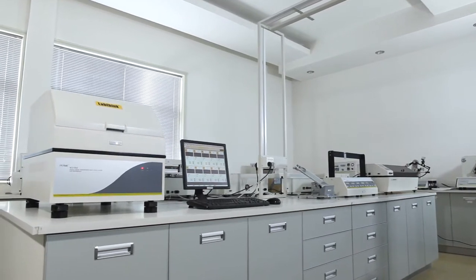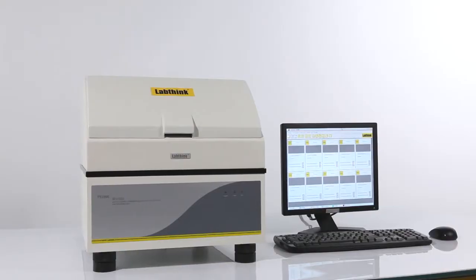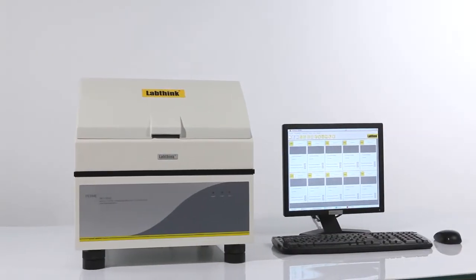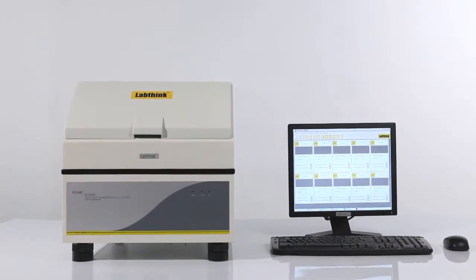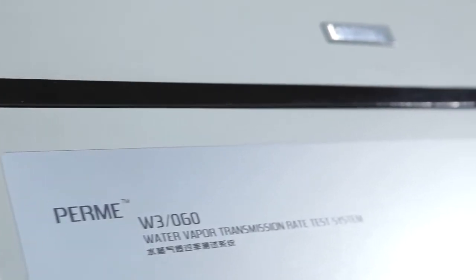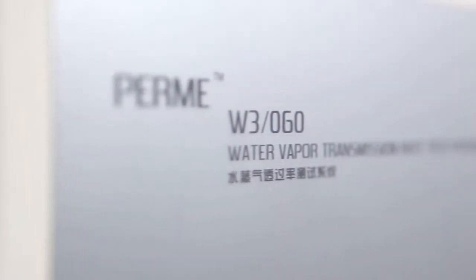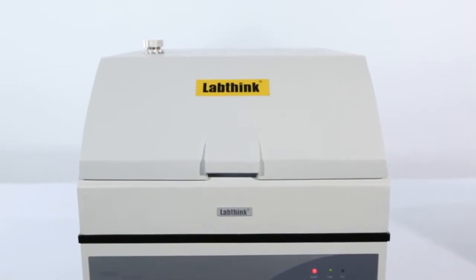W3060 is LabThink's latest generation of automatic WVTR testing system employing the weighing method, which is the fundamental and arbitration testing method for water vapor transmission rate test.